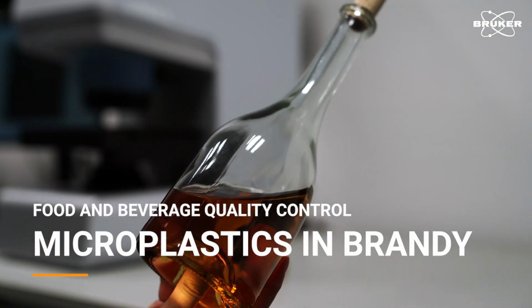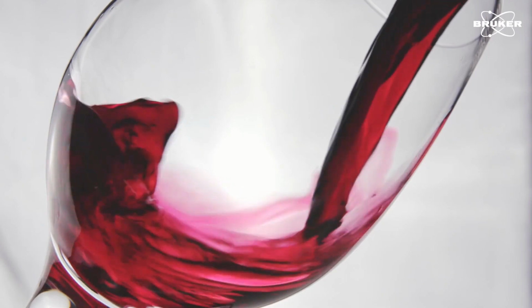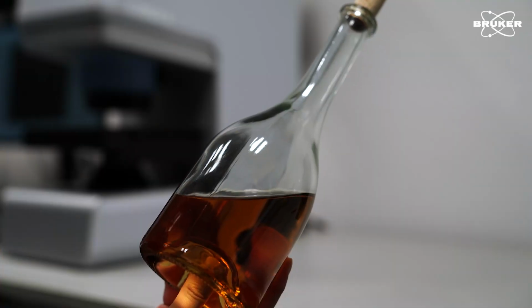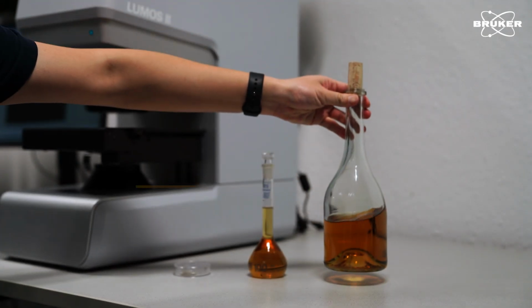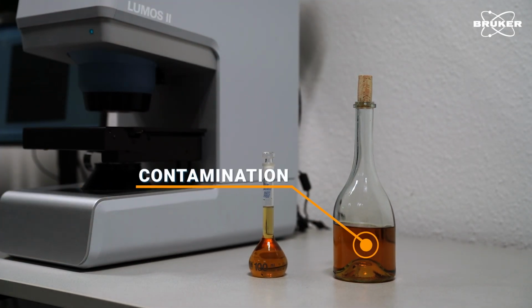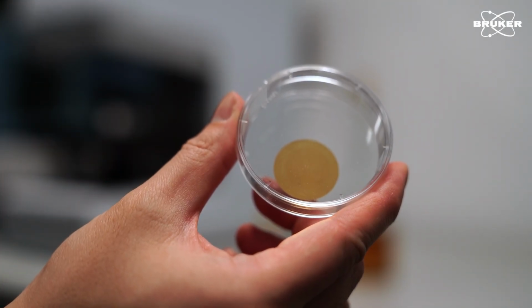This is a premium brandy. Such and other luxury beverages like fine wine or expensive whiskey are subject to strict quality control. In this video we are going to use FTIR microscopy to check the brandy for microplastics and other particulate matter. For this, a measured fraction was filtered through a gold-coated PET filter.